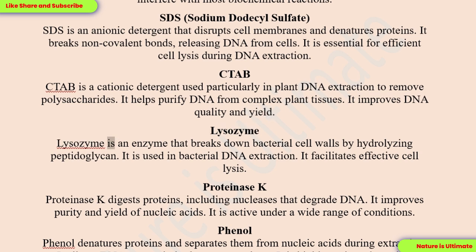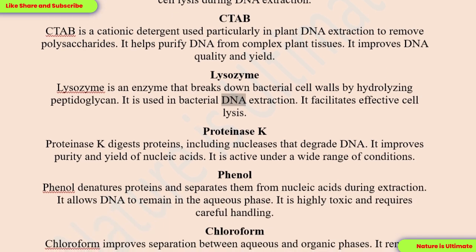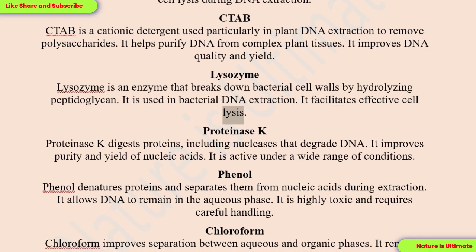Lysozyme. Lysozyme is an enzyme that breaks down bacterial cell walls by hydrolysing peptidoglycan. It is used in bacterial DNA extraction. It facilitates effective cell lysis.